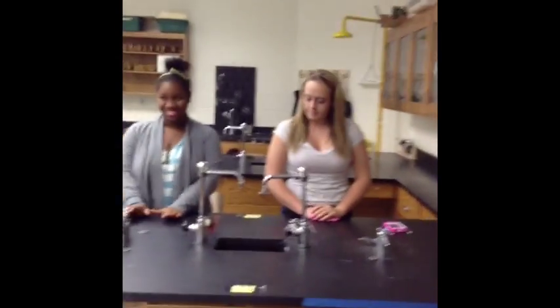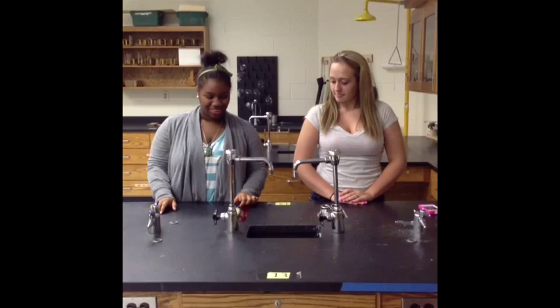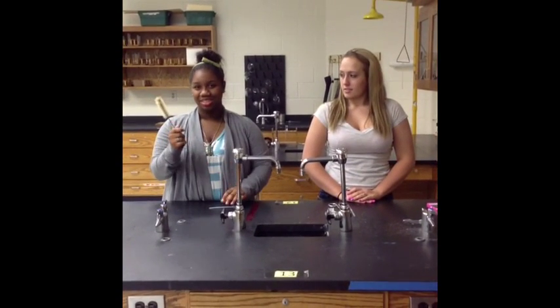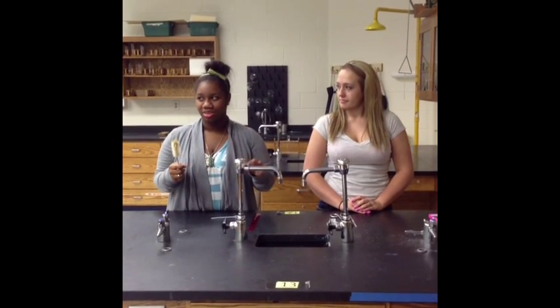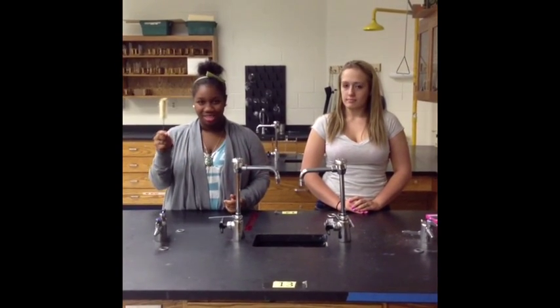I'm Gemma. And I'm Shonda. And we're going to show you some more equipment. So, this is the test tube brush. You use this after you're done putting solutions in a test tube — when you pour them out, you use this to wash the test tube.